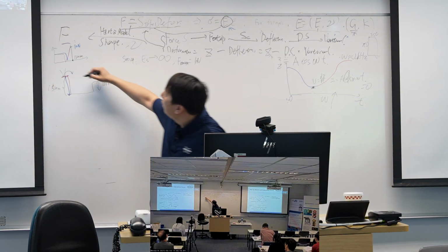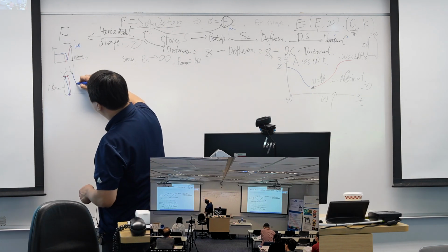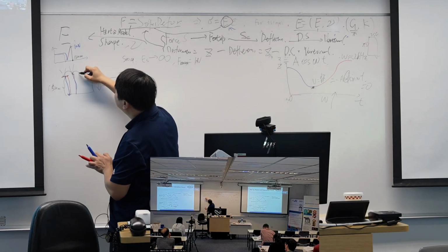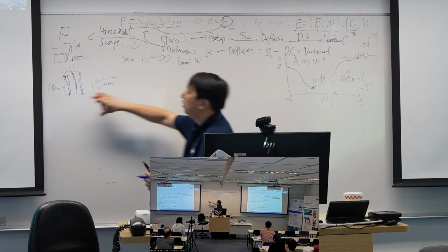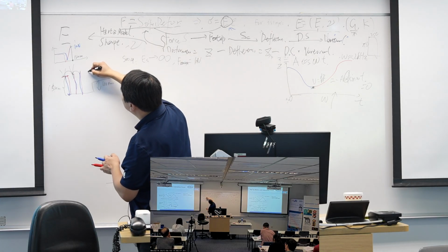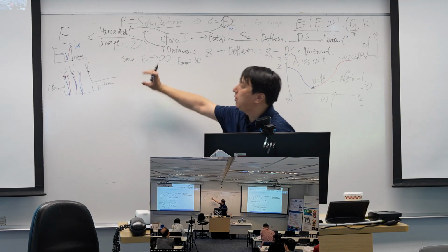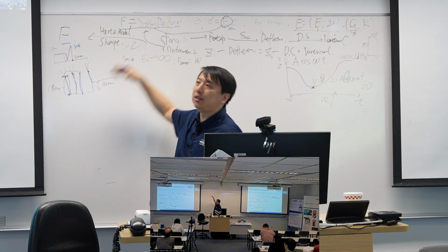And then my probe is going down and going up again to this step. And then it jumps down, up, continuously. Once I reach this point, my probe will go down, but my step is going down, and it reaches the step.